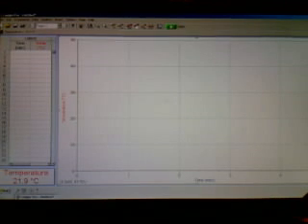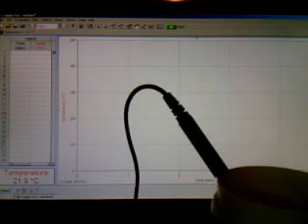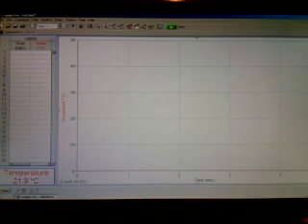Okay, and I'm going to do what I used to call, when I was a bench chemist, dump-in chemistry. I have a little cup and the probe is right in it. And so what I would be doing now, if it were really in a lab situation, I'd be talking about being very quantitative about how you measure things, but I'm going to simply dump in some water that I just boiled from the tap. And these stainless steel probes are very sturdy.